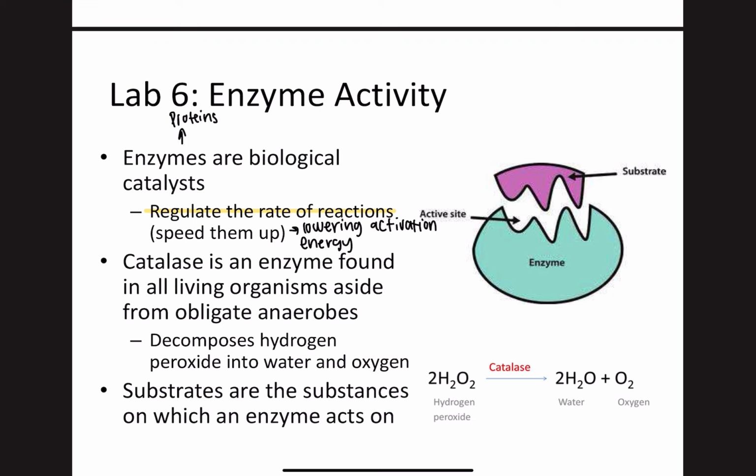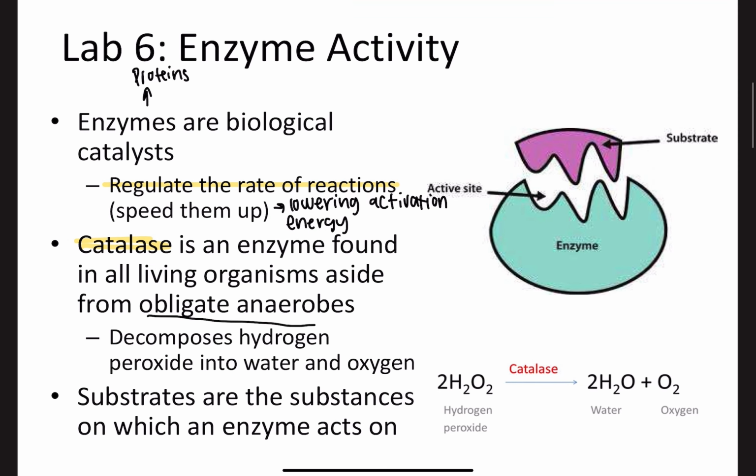In this lab, we experimented with the enzyme catalase. Catalase is an enzyme that is found in almost all living organisms except for obligate anaerobes. An obligate anaerobe is an organism that can only grow in the complete absence of oxygen.